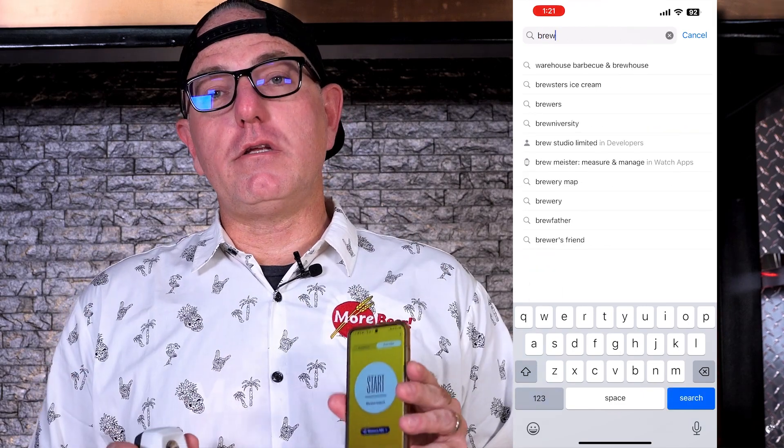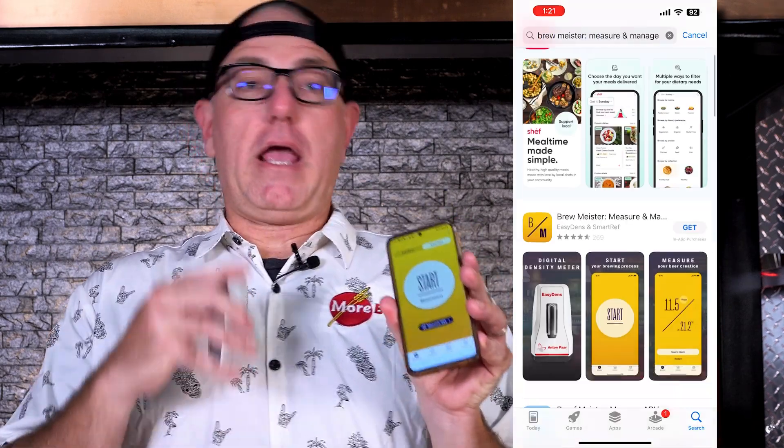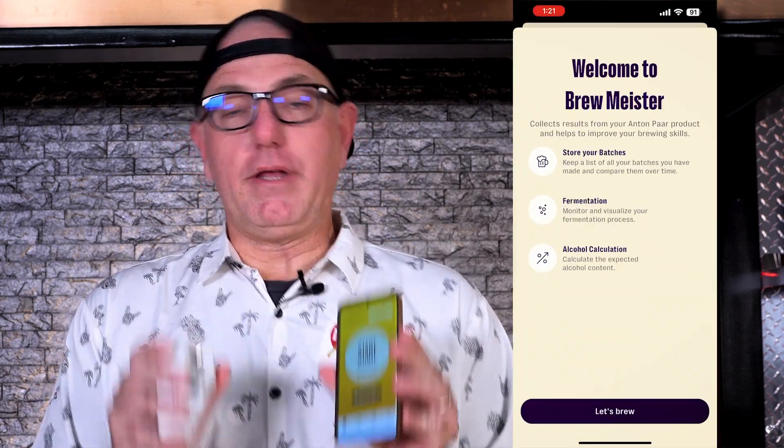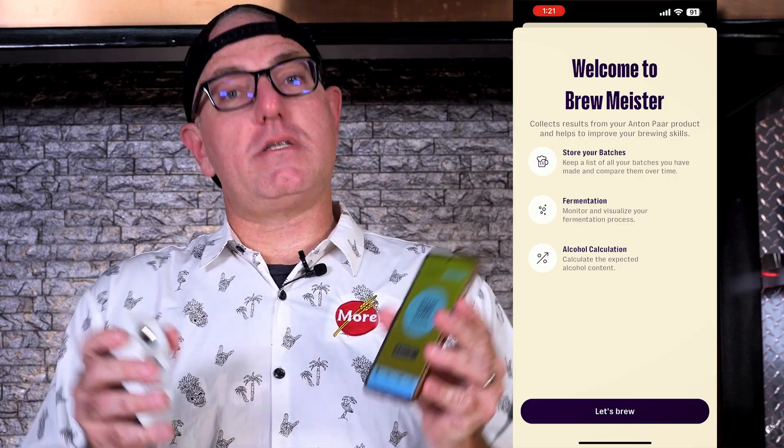The very first thing you need to do is download the Brewmeister app on either the Android or Apple phone store and install that on your phone. Make sure Bluetooth is on, then you're going to simply connect to it and then you're ready to take a measurement.